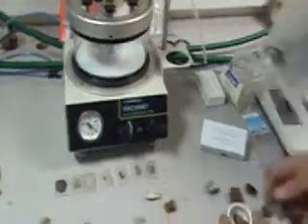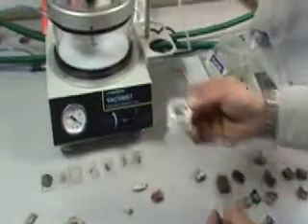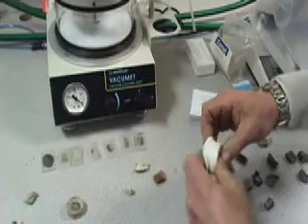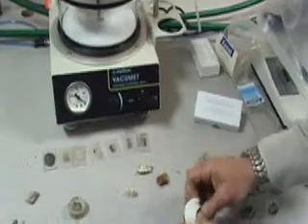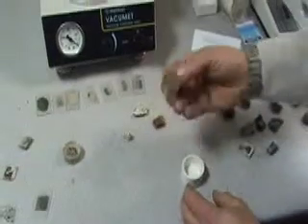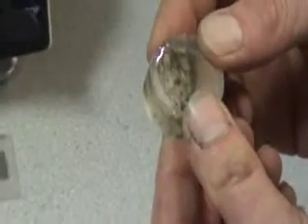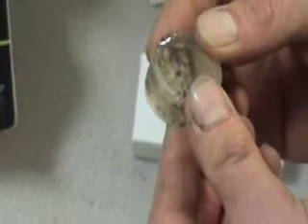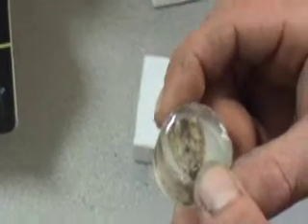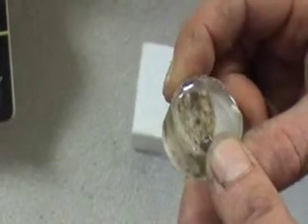After twelve hours, remove your sample from the vacuum unit and prize out of the rubber holders. This sample can then be either placed back onto the geocut to trim, or the geoform to create the size of sample you require for the next stage.